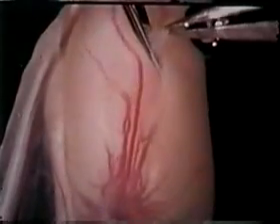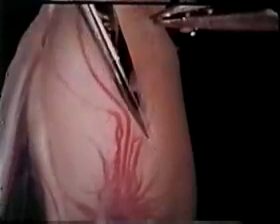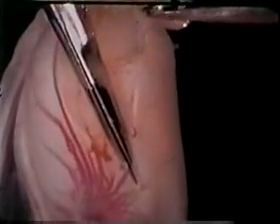Let us now make a longitudinal cut in the tunica albuginea of a testis, which has just been removed. The seminiferous tubules may be pulled from the testis as long, delicate threads. If one of these tubules is placed on a microscope slide and the surrounding fluid withdrawn gradually, the cellular content exudes from the cut end.